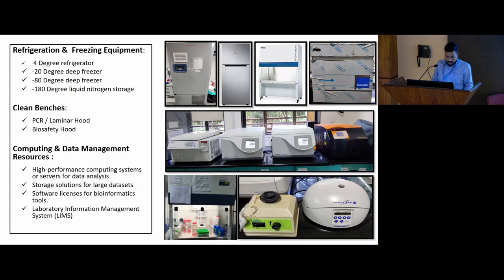Investment in freezing equipment is also important to store the samples and reagents. So invest in minus 20, minus 80 and minus 180 degree storage, which requires power backup supplies. Use laminar flow hoods and biosafety cabinets to maintain a contaminant-free environment.